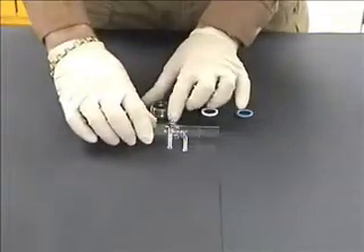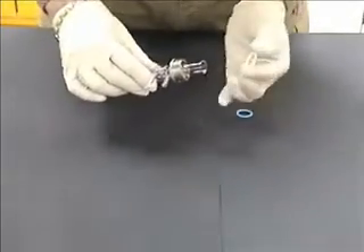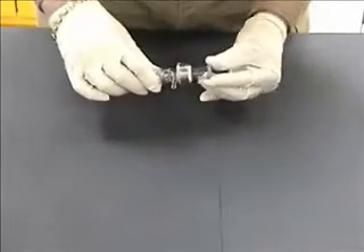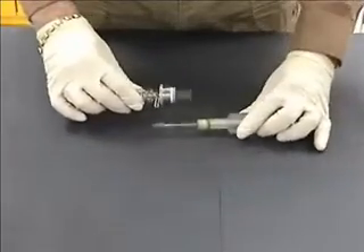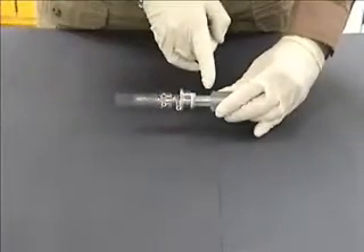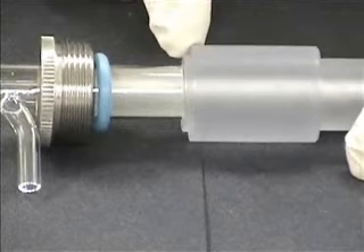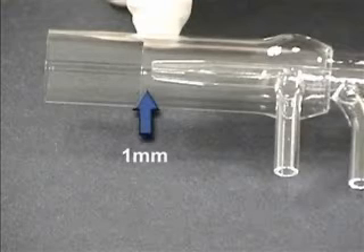Reassemble the torch by first sliding the internal Z adjustment nut over the torch quartz, followed by the white Teflon spacer and the blue torch O-ring. Carefully slide the quartz torch onto the torch adapter using a gentle twisting and pushing motion. Make sure the torch is fully seated against the torch adapter with no tendency to move away. Verify that the injector tip is approximately one millimeter below the end of the inner quartz tube.